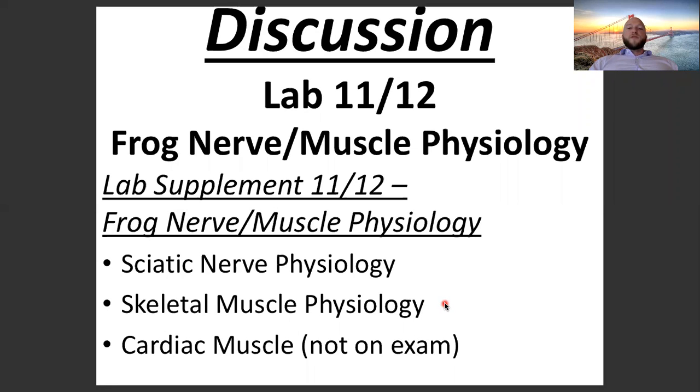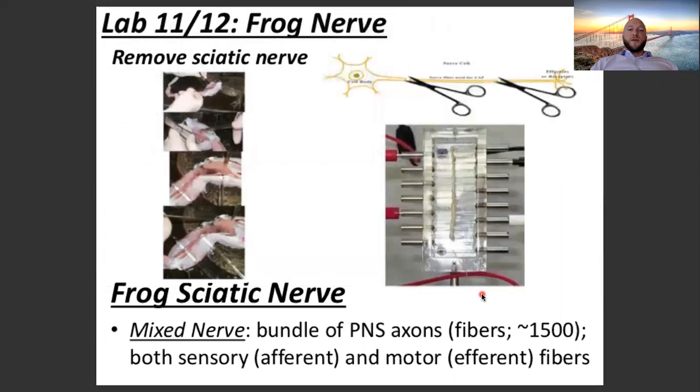So we're going to start to shock the skeletal muscle of the gastroc of the frog once a second for a few seconds. See how that changes the amount of force generated. Twice a second, then 4 times a second, 6 times a second, 8 times a second, 10 times a second, and so on. And seeing how frequency affects the amount of force generated.